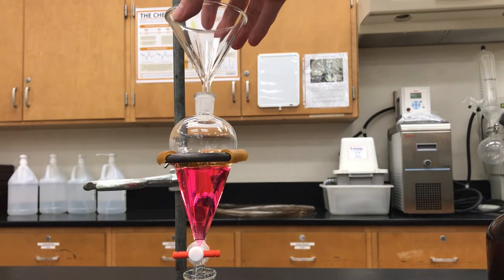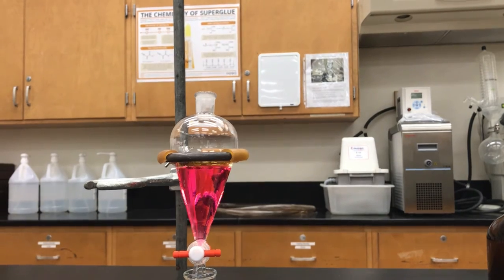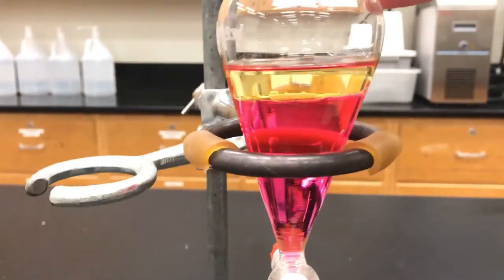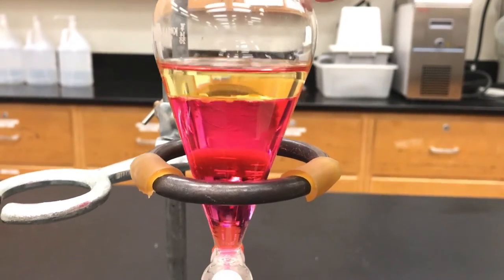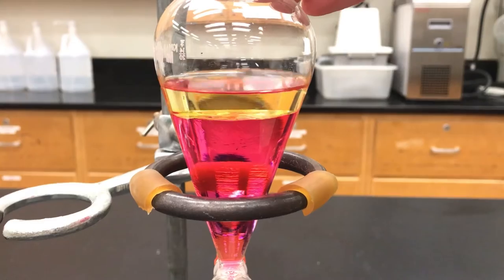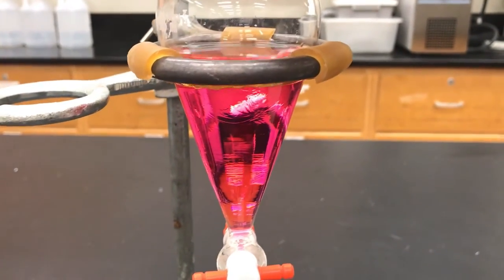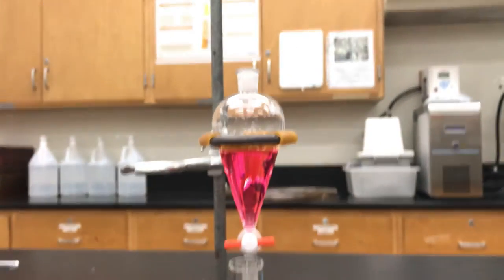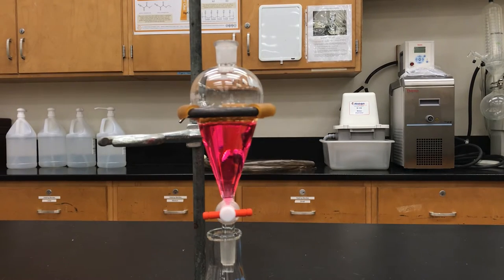I can remove the funnel and notice that not very much liquid got on the frosted joint. Zooming in you can now see that there are two layers in the separatory funnel — the bottom is aqueous, the top is organic, and we're already starting to get some color in the organic layer. The ethyl acetate originally was clear, but the methyl red is already being pulled into the top layer, and it looks different in an organic solvent compared to the aqueous solution.